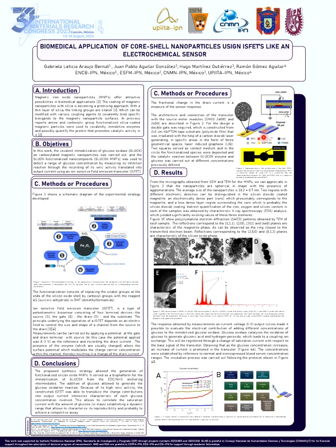forming a thin film. Another PET ITO substrate serves as a gate, and it was divided in half and had the dielectric material, PDMS, deposited using the doctor blade technique.